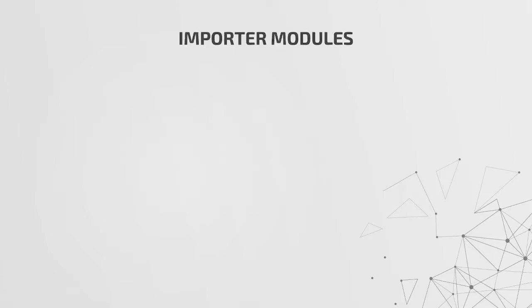So now that we've got that background information out of the way, let's have a look at actual import modules. Just to give you a feel for how the import modules work, when Iolite starts up, you'll quite often notice that there's a little bit of a gap between when it starts and when you see the window that has the list of recent sessions and recent templates. At that point, Iolite's going through and loading up all the modules.